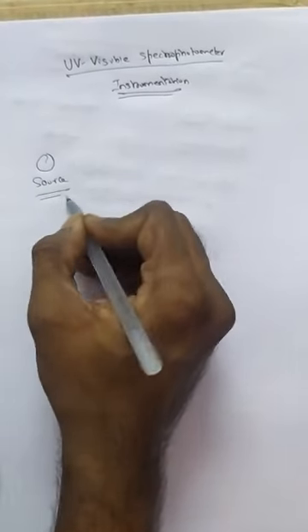In UV visible spectroscopy, the source of the radiation is a deuterium lamp or a hydrogen lamp. Deuterium is nothing but an isotope of hydrogen. Normally the deuterium lamp, which is a little bit costly, is the source for the UV region, and the source for the visible region is normally a tungsten lamp.